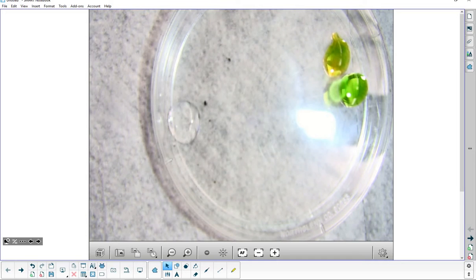So I've got to make sure I'll decide when we're stopping it. Because if we stop it at different times, then it's not consistent. Our results are going to be bogus. Okay? So you've got to decide, okay, I'm going to wait until all the green's gone. Or I'm going to wait until I first see the dark orange appear, or whatever. Okay? Just be consistent, because as long as you're consistent, you'll be able to get a good answer.